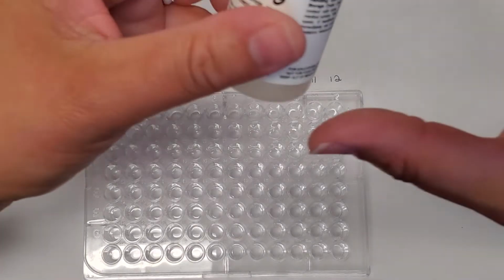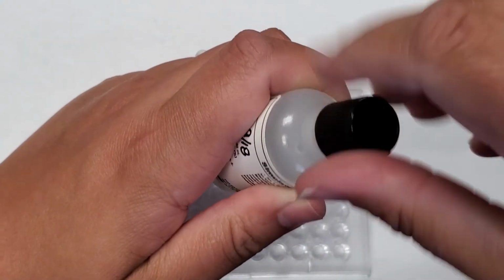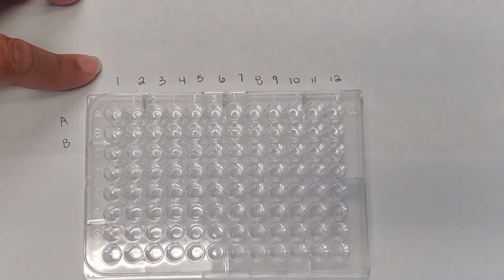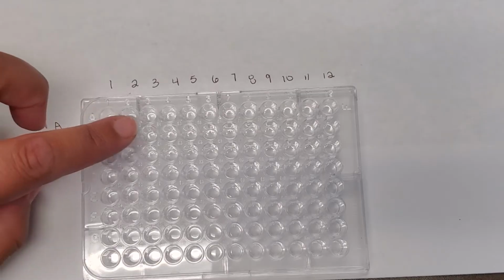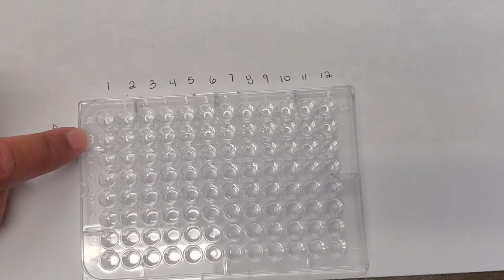So the first thing that we're going to do with our ELISA is we are going to use the simulated antigen, which is basically the disease-causing pathogen. So what we're going to do is add it to our wells initially. You notice that I have our wells here labeled 1 through 12, rows A and B. So we have patients A through F, and we have a positive and a negative control. And with that, again, we need 3 different wells for each patient because we're testing them 3 times. So we're really going to be using rows A and B entirely.